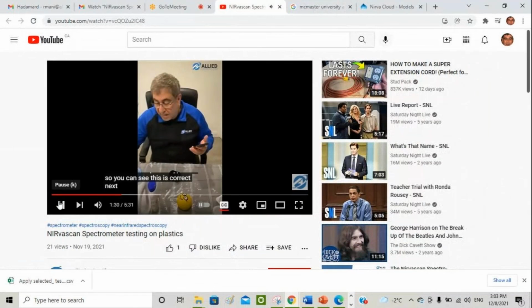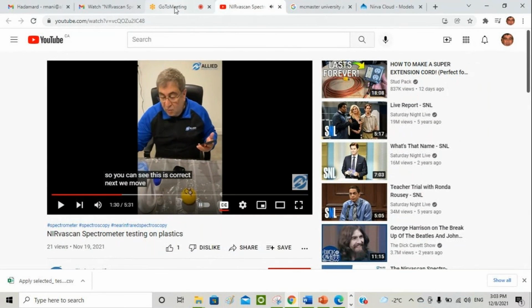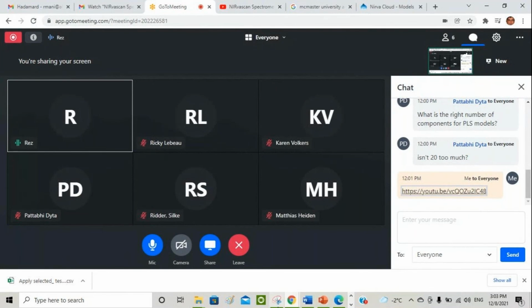I'm not going to show this whole video because you could watch it later, but you could see that you could develop an app that would communicate with the cloud. The cloud would run a model and give some answer back. So we have done that for an LDA model so far for plastics, but there is no reason why we can't do it for a PLS model. But you need to build a calibration model, and then we can use that to develop this app.